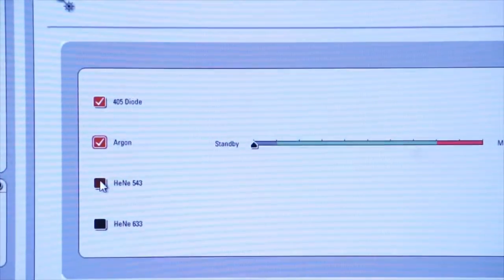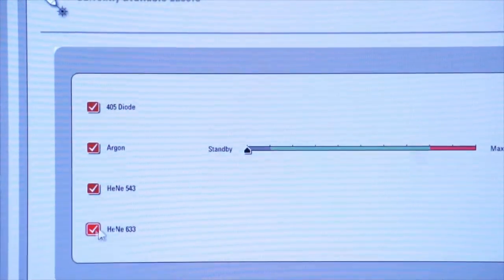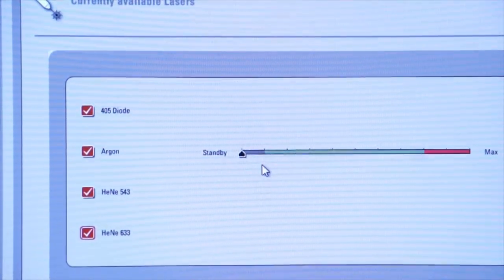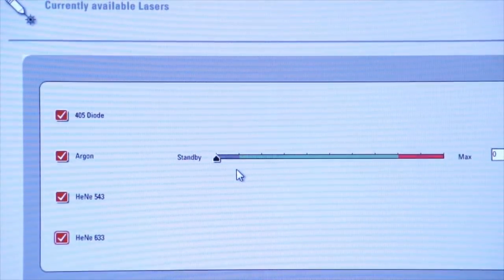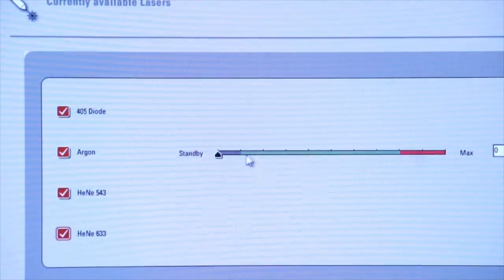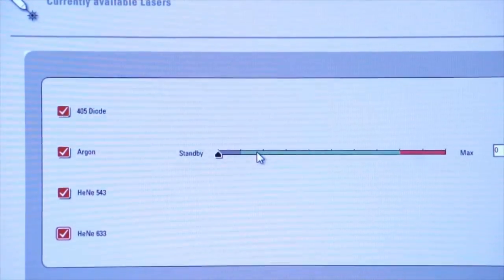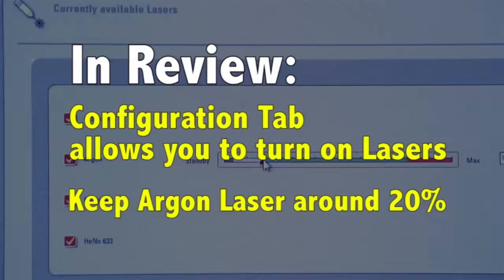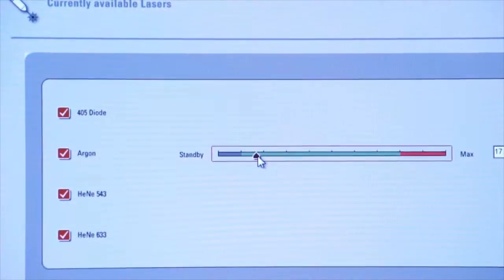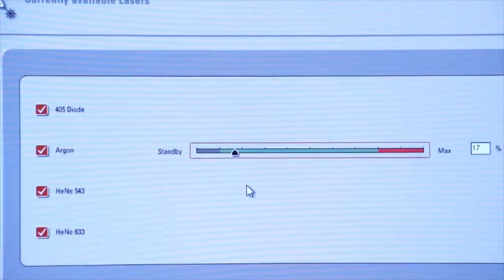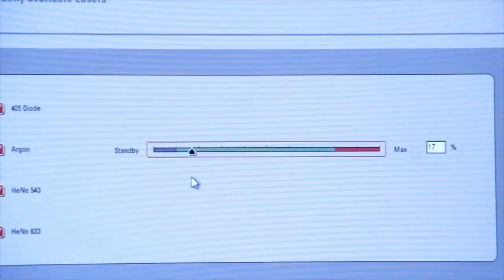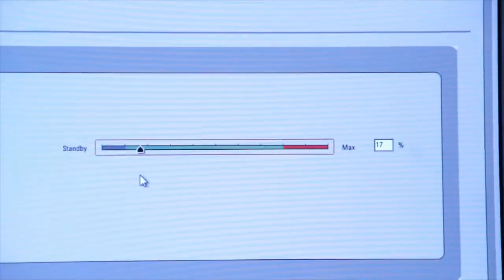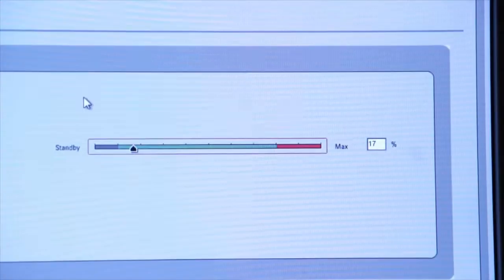We have to apply power to each laser so that they're available to us during live imaging. For the Argon laser, we also want to select a power of about 20 percent. So we click on that, and it comes up. In this case, it's up to 17 percent, which is fine. Anything at 20 percent or under.